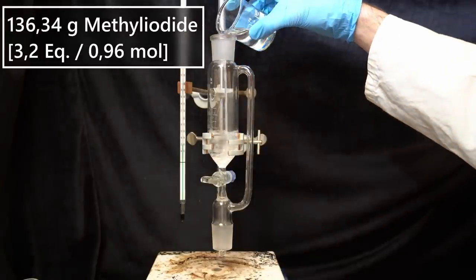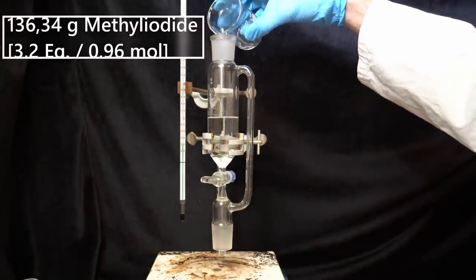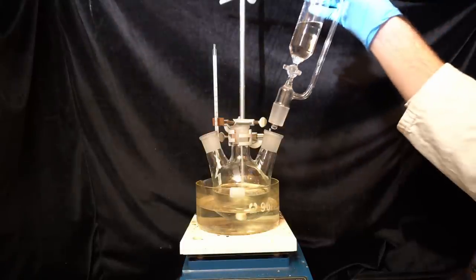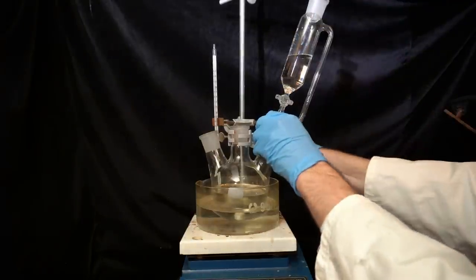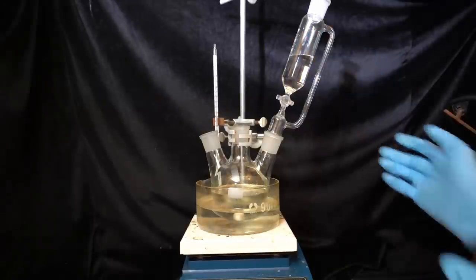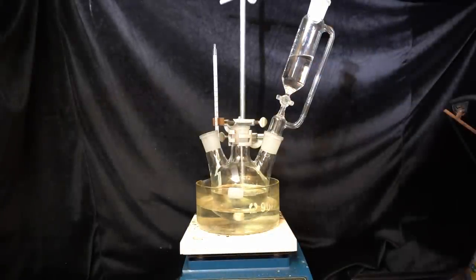136 grams of methyl iodide are transferred into a 100 milliliter addition funnel and placed on one of the side necks of the round bottom flask. The methyl iodide is used in large excess which is typical for this type of reaction which is referred to as an exhaustive methylation.